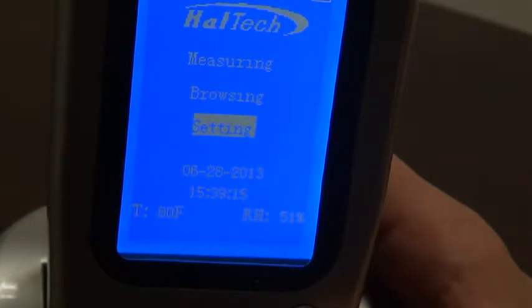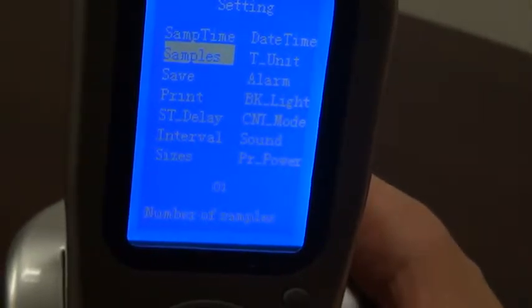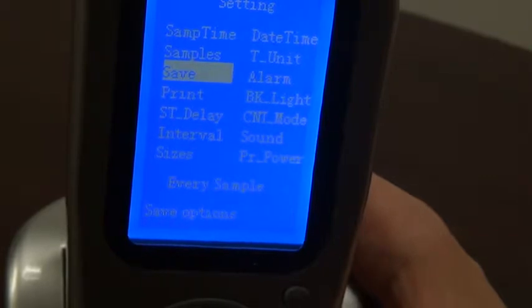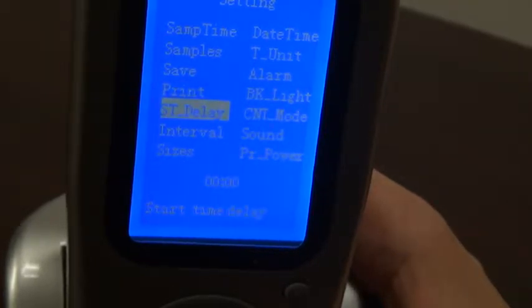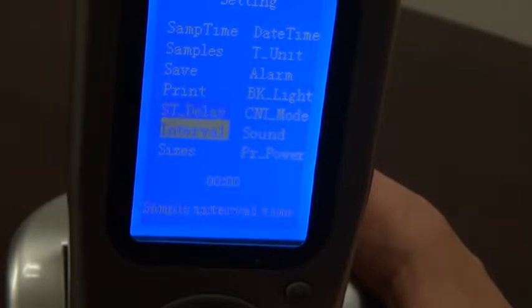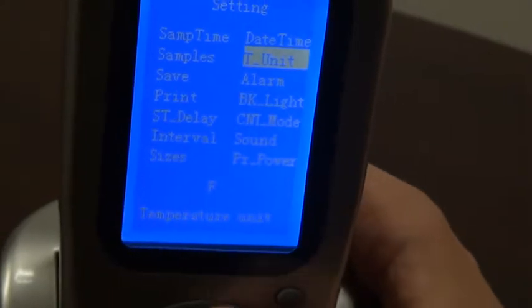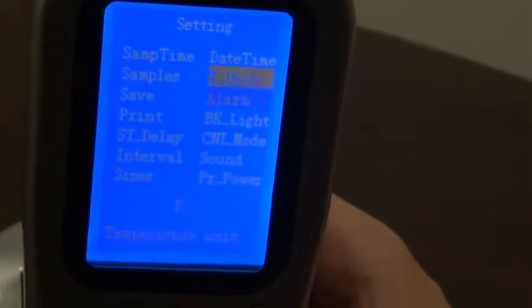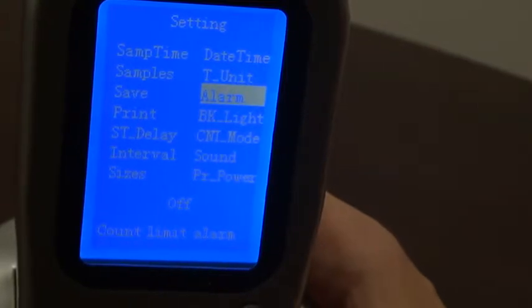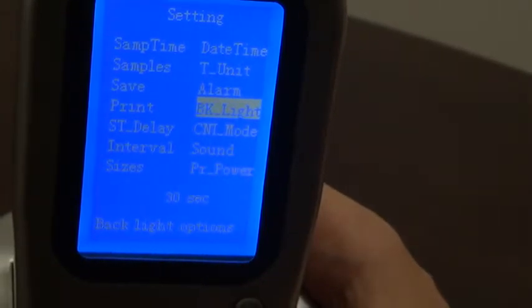Let's start with the setting screen. On the setting screen, we can choose the sample time with second resolution, the number of samples, whether we save every sample or not, the printer whether it is automatically on or not, the start time delay, the interval between samples, the actual size bins to group the particles, the date and time, temperature in Fahrenheit or Celsius, whether or not we use the alarm condition, and backlight on or off, or what delay before it does shut off.